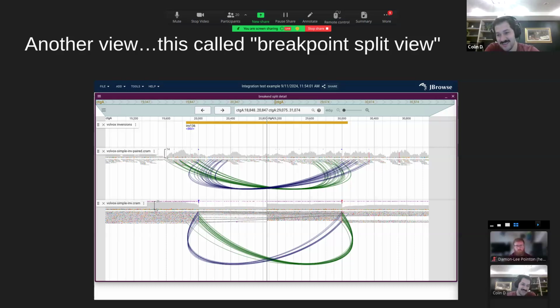Sometimes that's actually enough to see things like a CNV, that's a structural variant. You could also conceptually make another type of bigwig that's a derived data type that shows you the amount of reads that are badly paired at a certain position. That could give you a signal of an inversion.